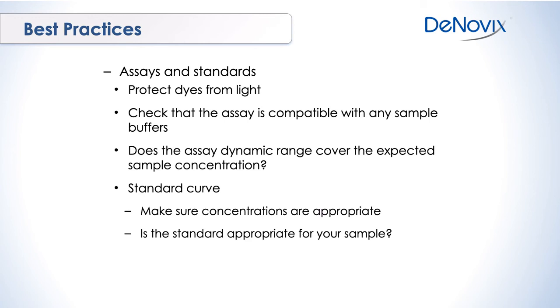It might be if you have a very, say, GC heavy, GC rich sample, that actually using the standard that's supplied with an assay kit isn't really appropriate, and you should make up your own standard, but that's something you need to test empirically.